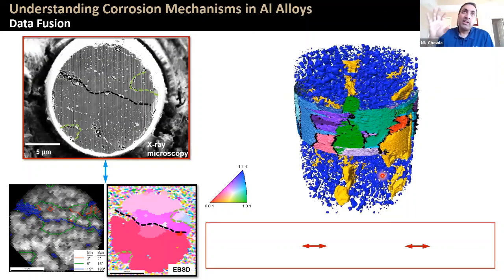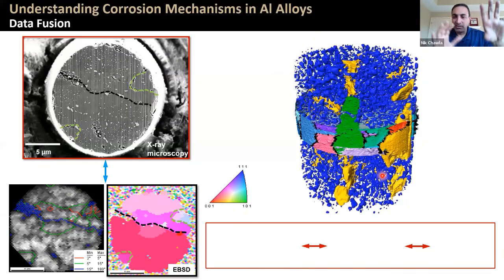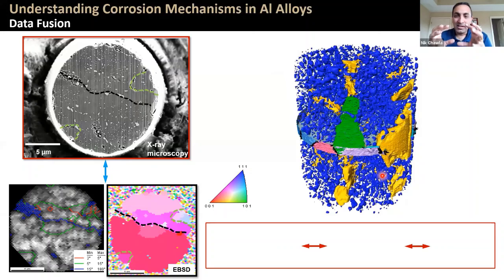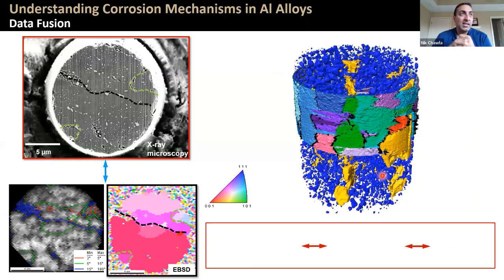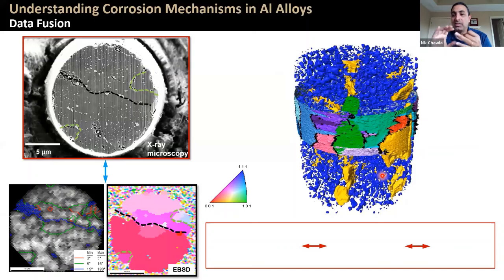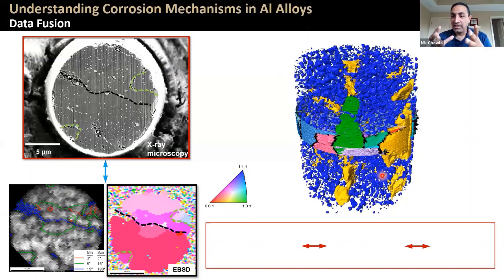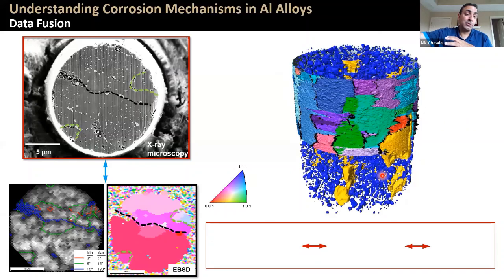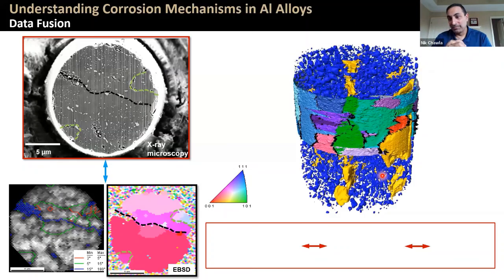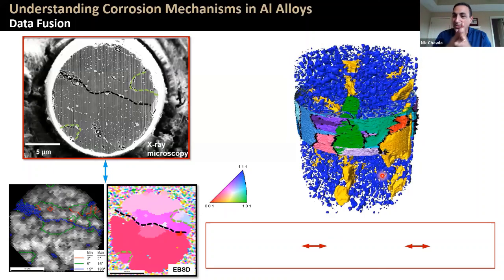And I think that if we can take the human component out of this, in addition to all of the image analysis and reconstruction that I've talked about, that third thrust is to really teach the algorithm the physics. Ideally, we could incorporate some knowledge into the algorithm about how grain misorientation and surface energies affect the susceptibility to corrosion, galvanic cell kind of information, and then maybe you could even predict this for a range of material systems, or even hypothetical material systems, prior to doing the experiment. And then we can target the experiments much more surgically on particular systems of interest.